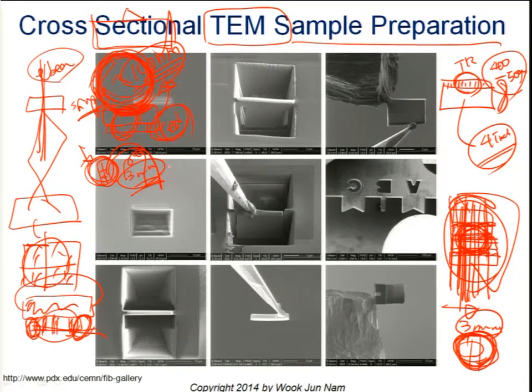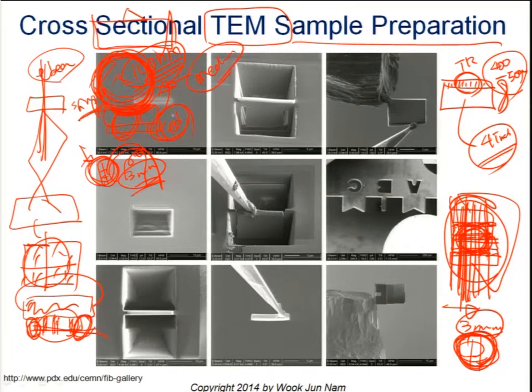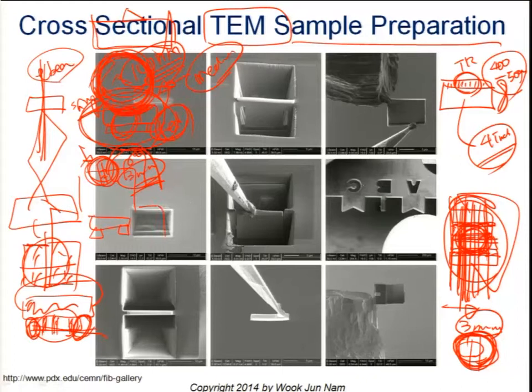After finishing this final mechanical polishing, we transfer these samples to the ion miller, which has a pretty small chamber. We load the sample something like this, and this special chamber has very well aligned ion beams focusing on the middle of this 3 millimeter diameter sample.